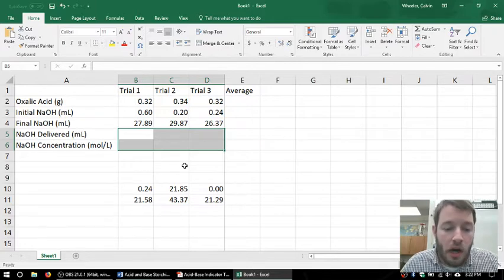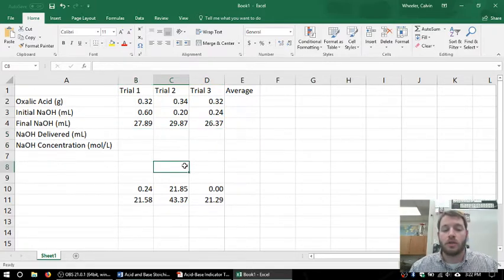And what I do not want to do is take my calculator and start calculating the answers and then typing them in. And once we get to finishing this, I'll explain why it is extremely beneficial to type and calculate in Excel rather than just transposing from a notebook. Excel is a lot more than just a nice table builder. It's actually a calculation mechanism.